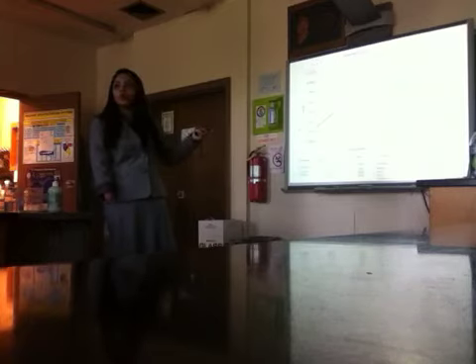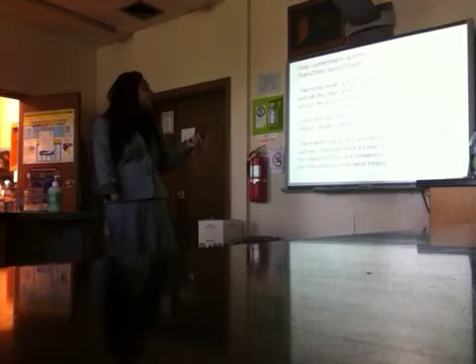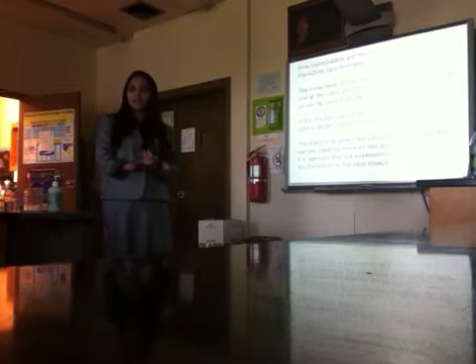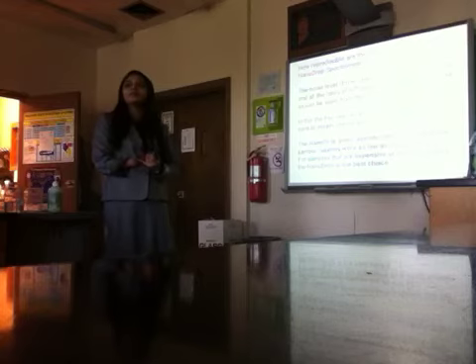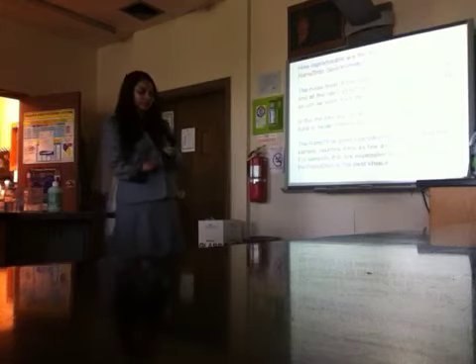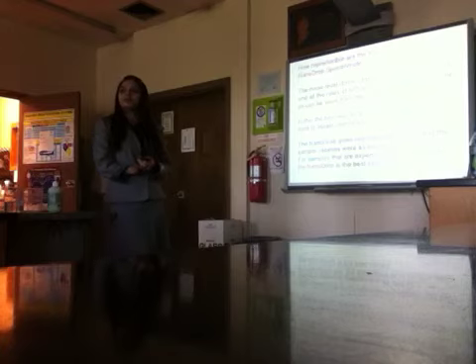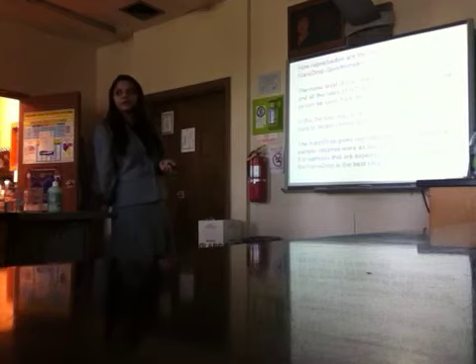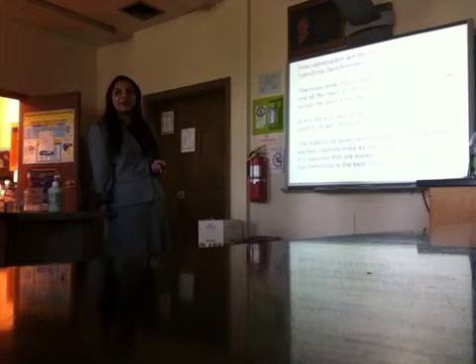But if you go back, this 5% represents not just the error of the instrument. It represents all the errors in your experiment together: your pipetting error, fluctuation in the concentration, maybe the drop, everything, in the pipetting and in the measurements. So that tells you that overall the accuracy of your work was good, because you can't expect to get anything less than 5%. So really, that means that you did a good job.